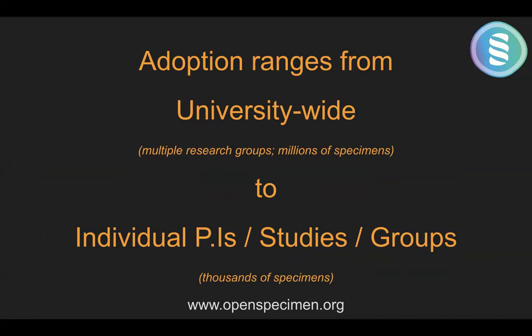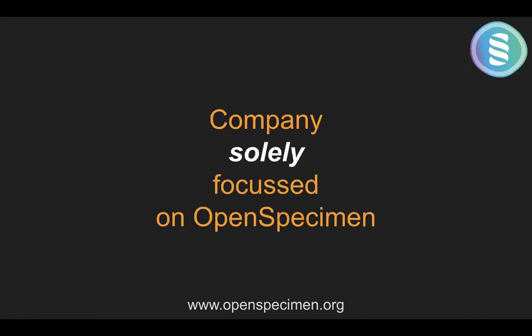But on the other side, we also have customers who are single studies or single research groups, single PIs using OpenSpecimen. So we have customers across all ranges.